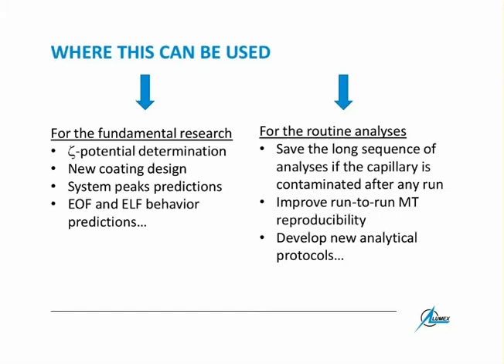This is the separation of proteins according to their molecular masses, and only according to molecular masses, so charges do not play any role. In this case, the capillary is filled with a gel, and you can inject.